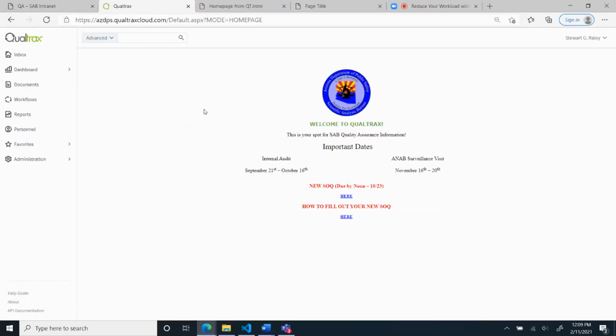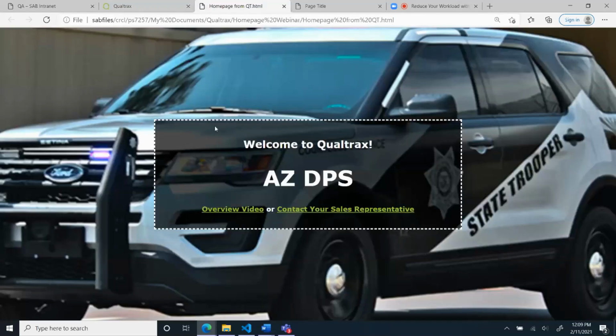The first thing that I did is when Qualtrax reached out to see if I'd be interested in this presentation, they gave me their splash page, their landing page, and they showed me how it works. It's very simple. And we went in and they changed the background picture to a DPS trooper car. And I thought, well, that's pretty cool. So let me see if I can work with that.